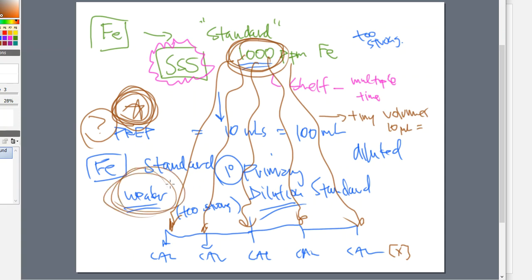I mean, that's the whole purpose of this. We weaken it down to a point where, okay, now we can prep everything else. And we might not need 10 microliters anymore. We now can go to a milliliter and 0.75 milliliters and 0.500 milliliters. Maybe that's going to be a little bit better than working with these really tiny volumes in the end. Nobody wants to do that, right? And the smaller we go, the more chances of error that get built into the system.